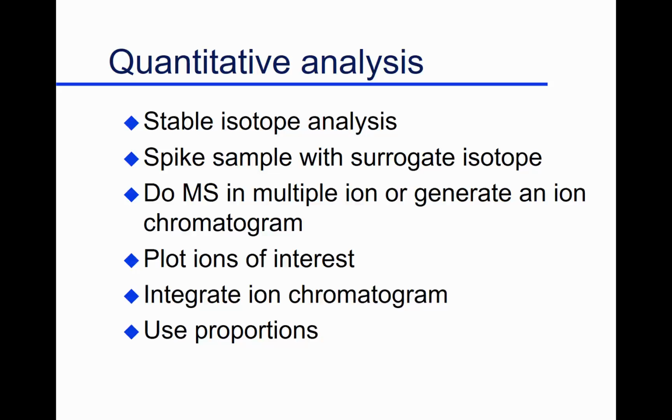That's oftentimes how we do it, but there's nothing better than spiking your sample, taking your sample and putting some benzaldehyde in. It has carbon-13 labeled, so it has carbon-13 in it. So your internal standard, your reference compound, is the same compound you want to measure, but it's got maybe 3 carbon-13s in it. And the mass spectrometer is absolutely great.